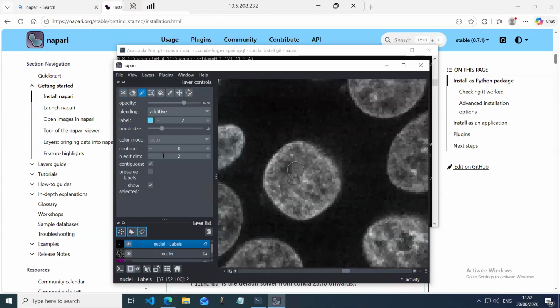I'm not seeing what is expected. That is, I should see this pixel being colored. So eventually, the brush size is okay. I'm probably doing what I was supposed to do, but in general, this should be capable of showing the annotated pixel. It would be a way to manually annotate data.